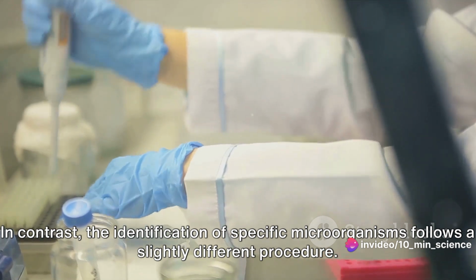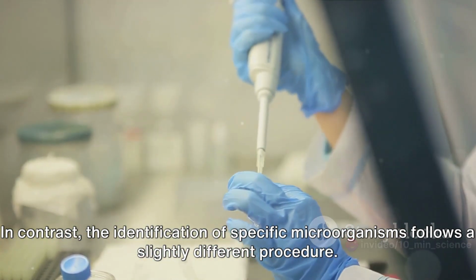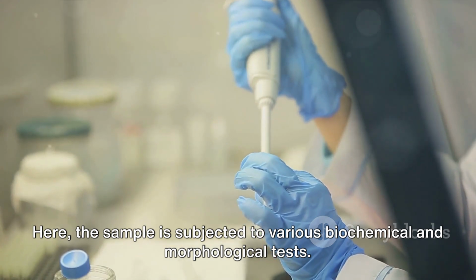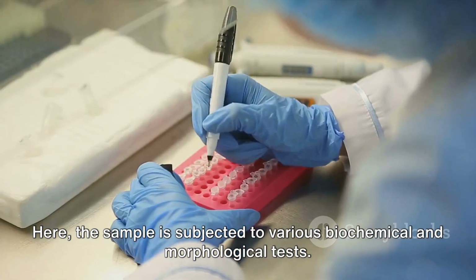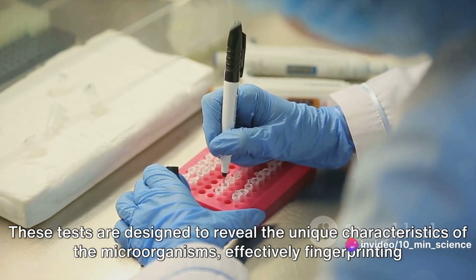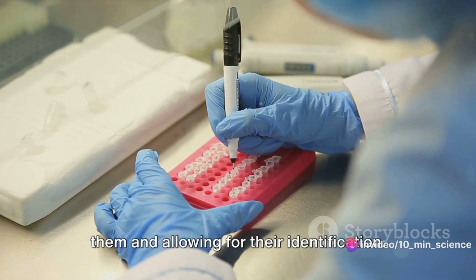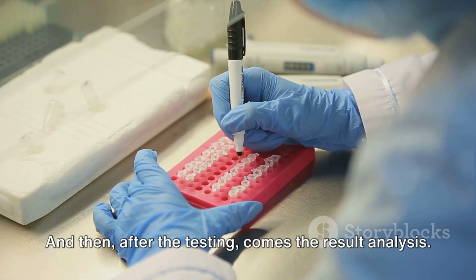In contrast, the identification of specific microorganisms follows a slightly different procedure. Here, the sample is subjected to various biochemical and morphological tests. These tests are designed to reveal the unique characteristics of the microorganisms, effectively fingerprinting them and allowing for their identification.